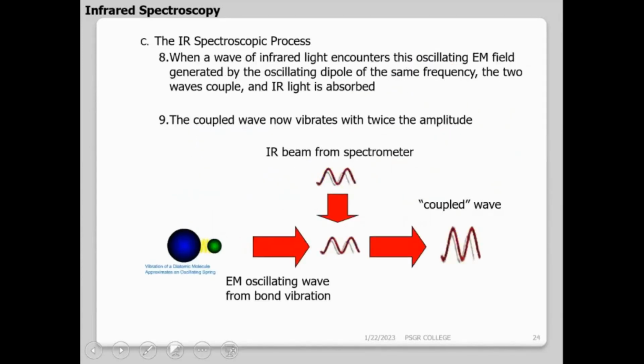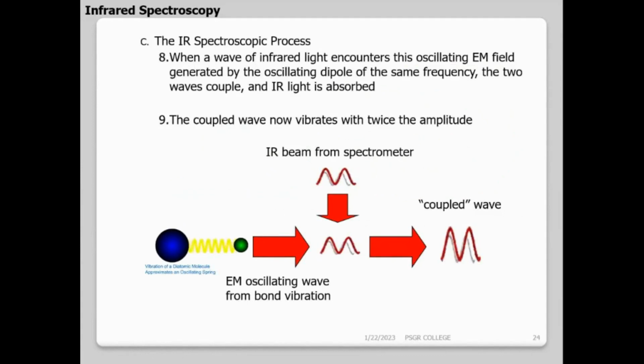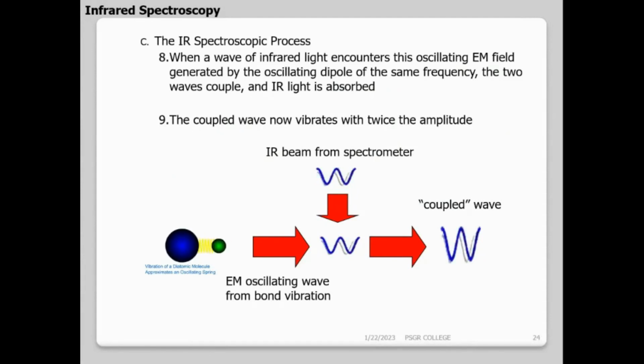So we'll go further. Okay, so what have we seen? Every bond, suppose a bond has a dipole, that oscillating dipole will create an electromagnetic field. We saw that in the first slide. And the strength of the field will depend upon how much dipole I have. So if I have greater dipole moment change, I'll have a greater oscillating field. Okay, now what I'm doing is giving an IR radiation from the instrument.